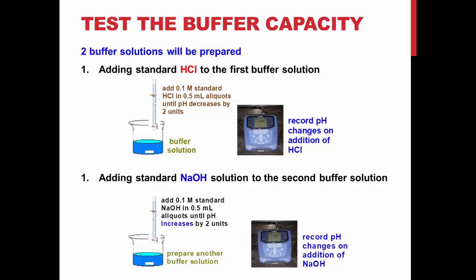Repeat this procedure with a second buffer solution, but adding 0.1 M sodium hydroxide from the burette to the solution instead. Remember to record the initial pH of the buffer.